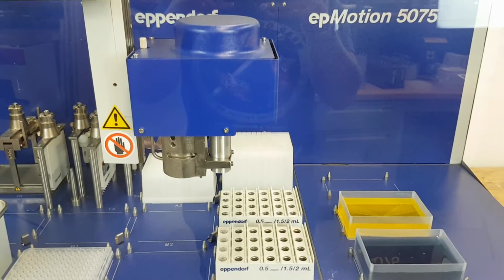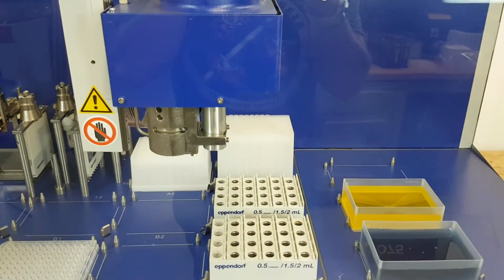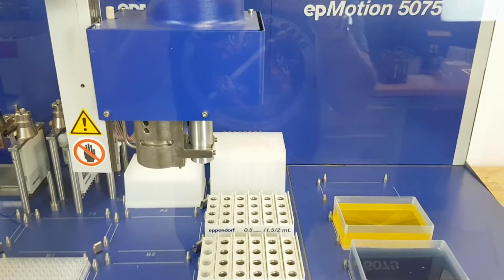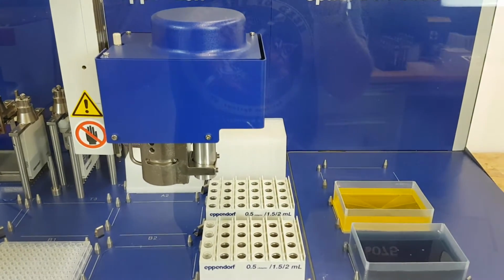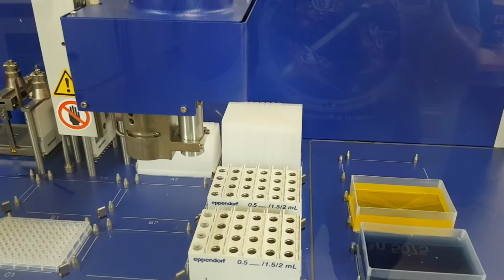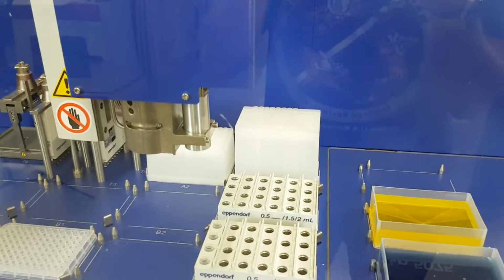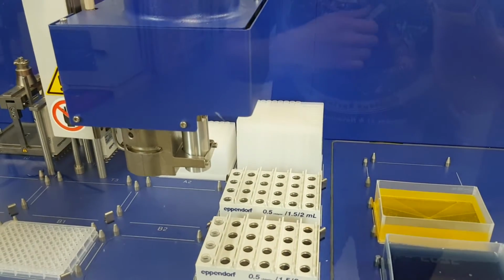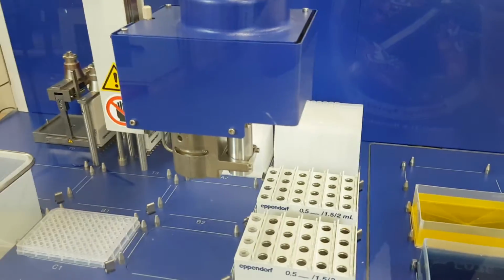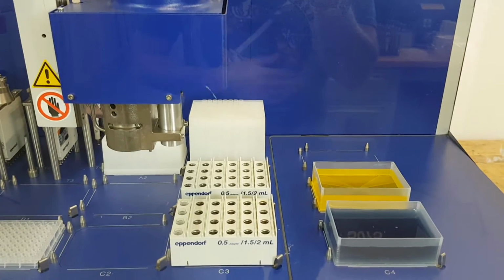It does take a little bit more time than it would typically because we don't have the exact model of tube that is supposed to go with the unit. So it can have a little bit of trouble seeing exactly what it wants to see, but it does sense exactly the level of the bins, and it does manage to sense the level of these. If it was unable to, it would give us an error on the computer. And in that case, we would be asked if we want to try to scan again, or if we do want to just continue without measuring the level.